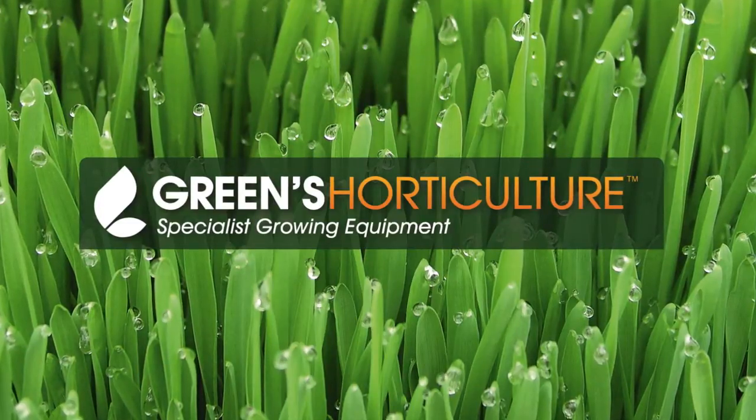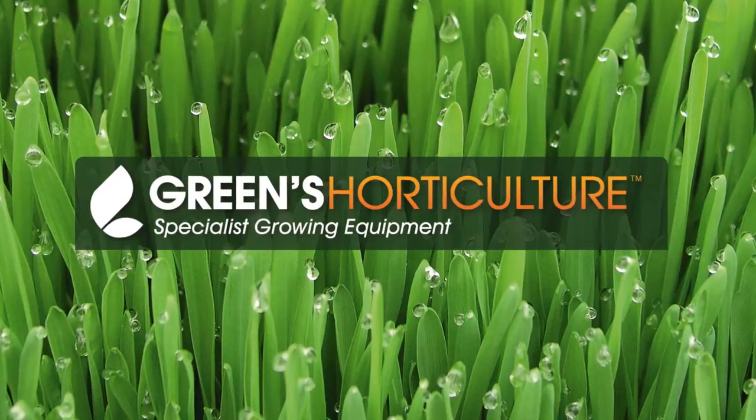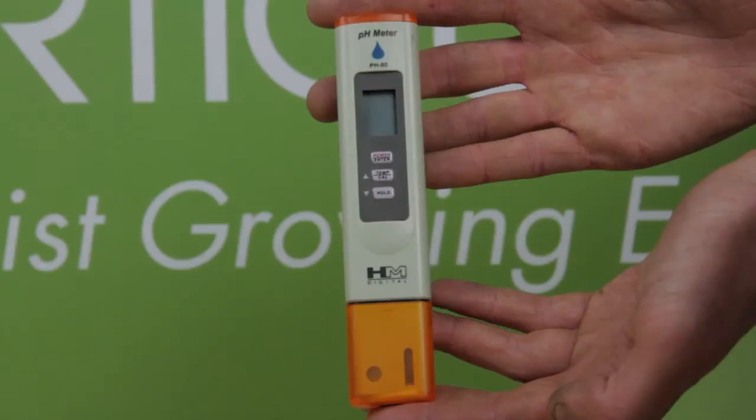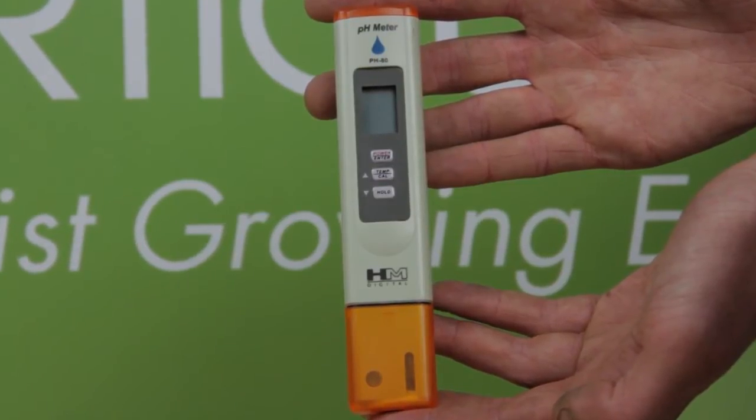Here at Greens we understand just how important accurate pH readings are to having a successful hydro grow. We're going to show you how to calibrate your HM digital pH meter.